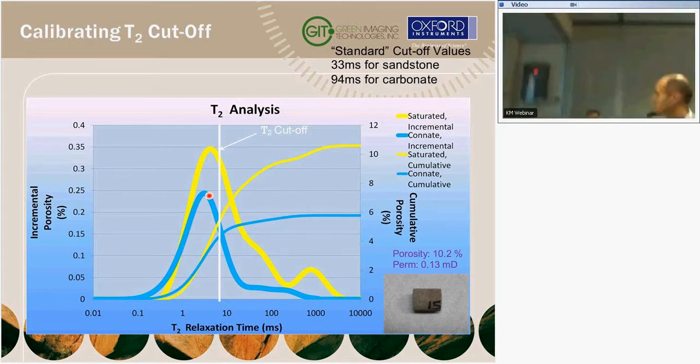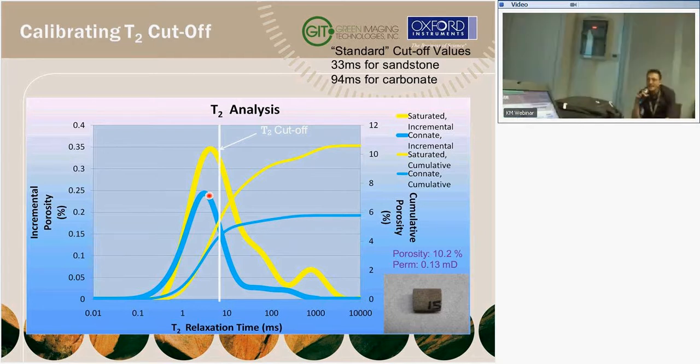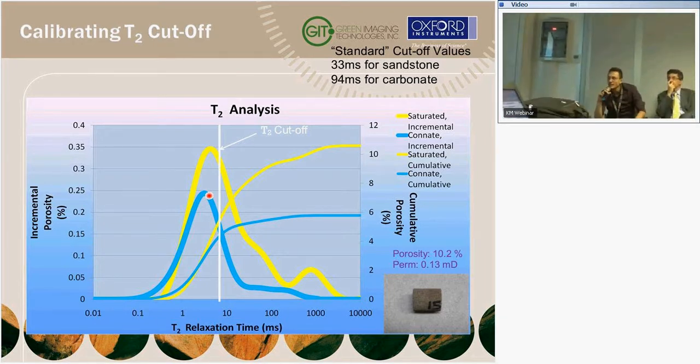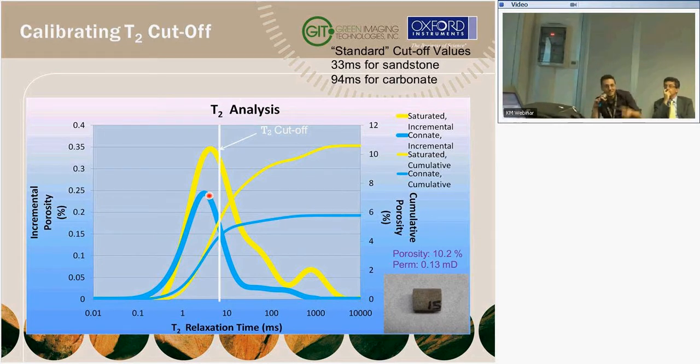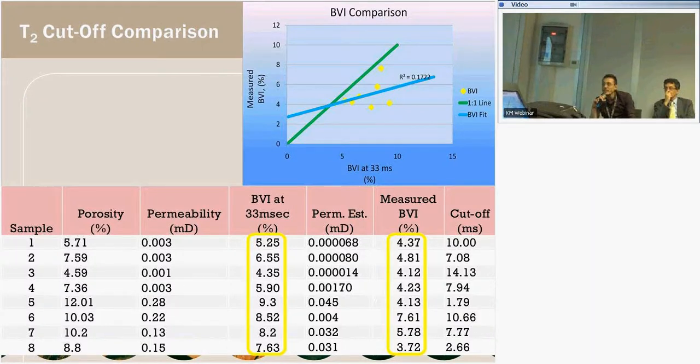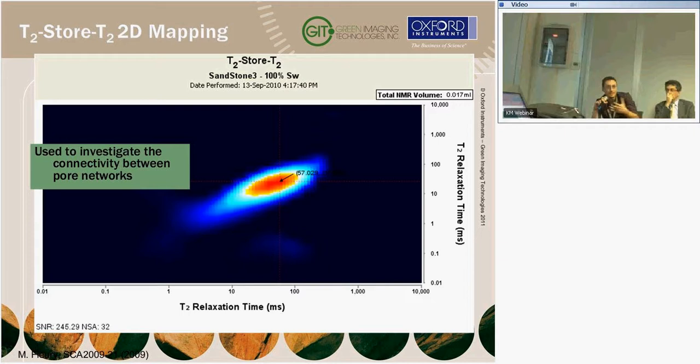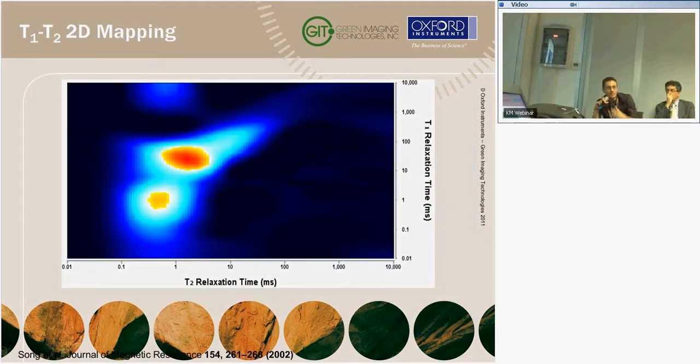Marco Pirrone from Reservoir Characterization Department. It is very interesting, the point that you mentioned with regard to the question by Maurizio. So you say that in that kind of plot you are pretty sure that maybe one of the signals can come from the hydrogen, the gas, in the shale. Is it right? The T1, T2 map?